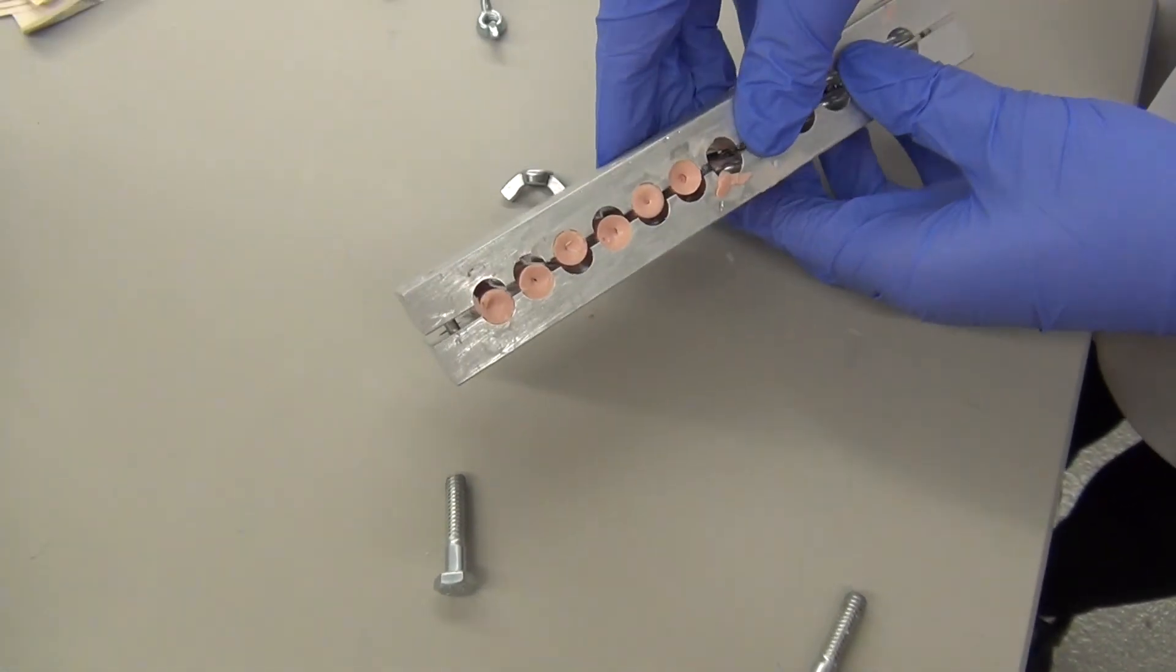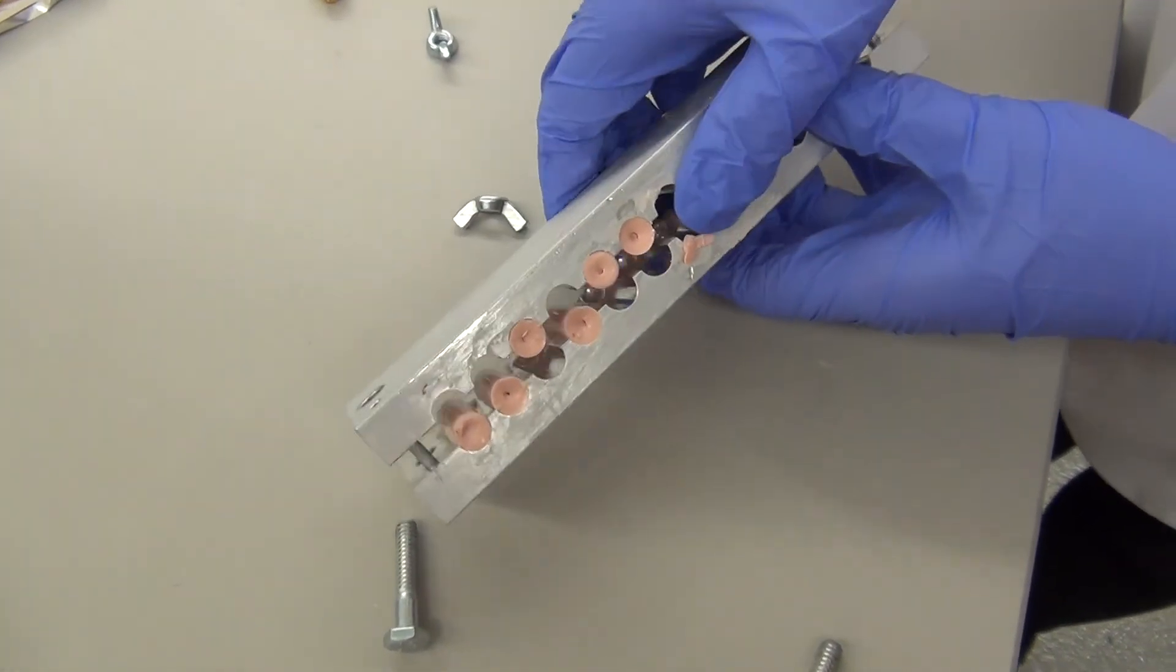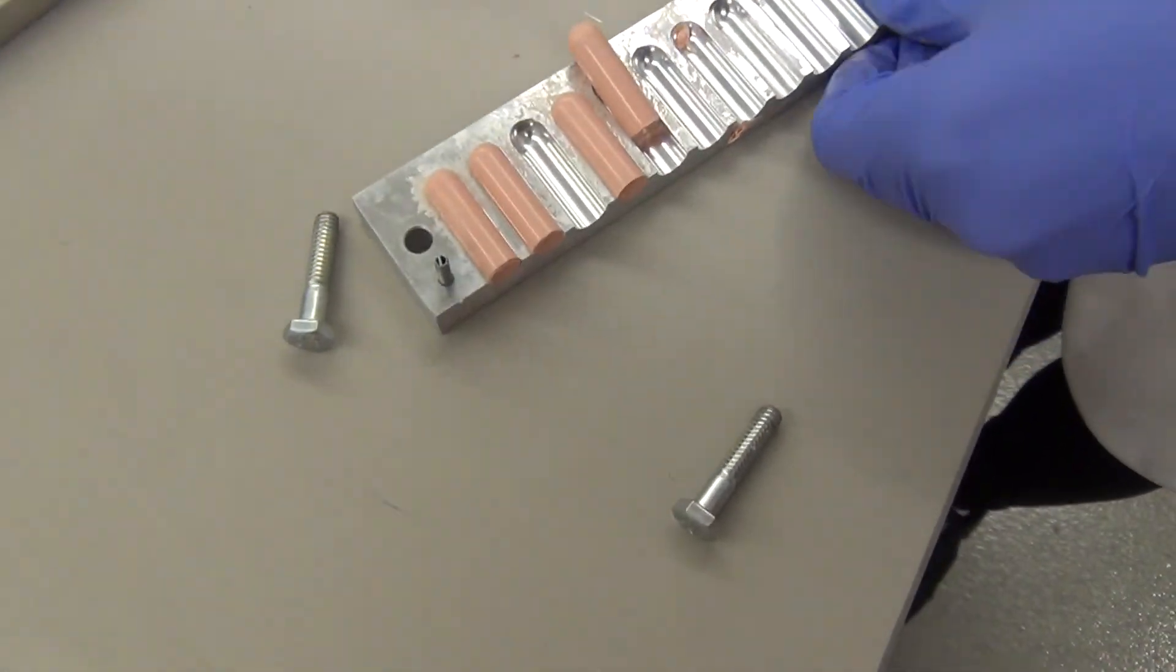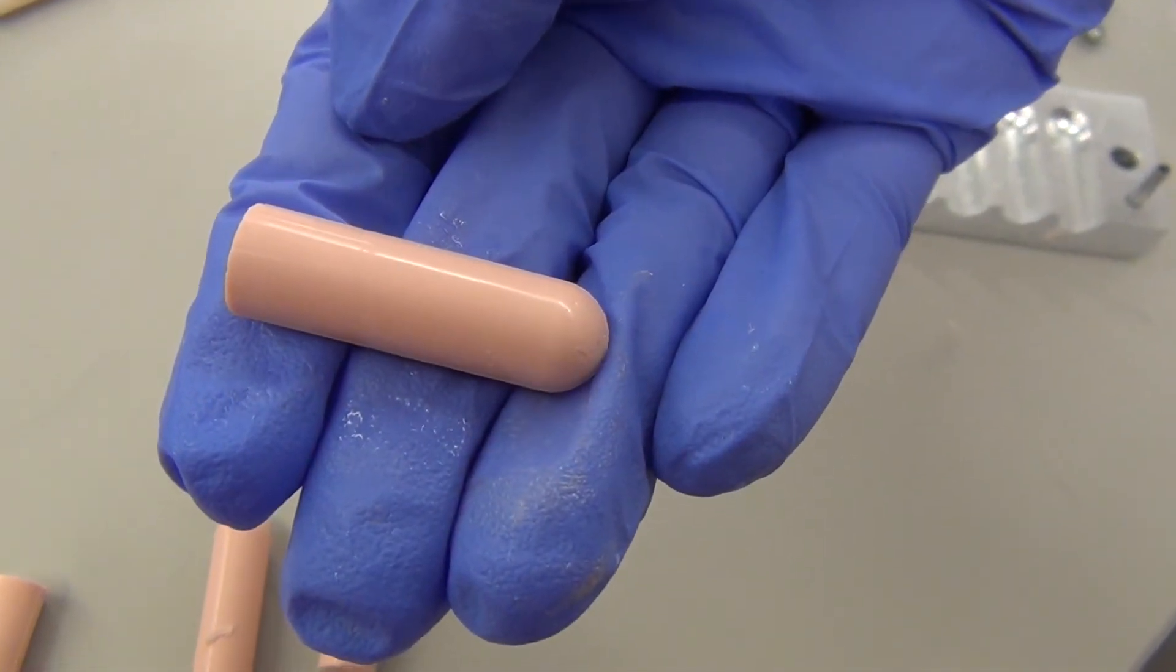Remove the suppositories. They should appear smooth and free of any air pockets.